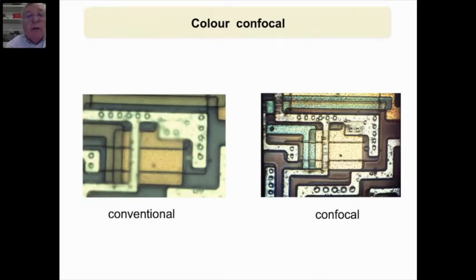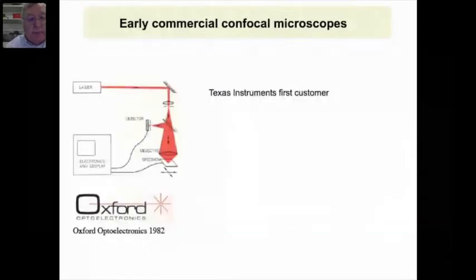The early commercial instruments, this is one from Oxford Optoelectronics, which we set up in 1982. This actually had stage scanning. Texas Instruments was the first customer.